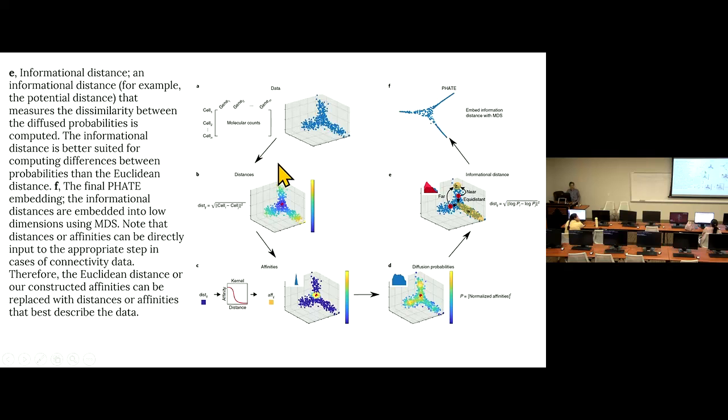Then as long as you have a distance matrix, this will be a big matrix. If you have 2,000 cells, the matrix will be 2,000 by 2,000. Each position tells you how far from one cell to another. Then the next steps are all the different kinds of transformation, filtering, enhancement to make this distance matrix better capture the global structure and also reflect the distance between cells.